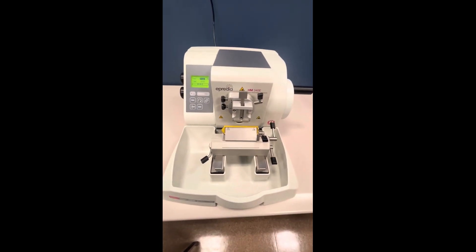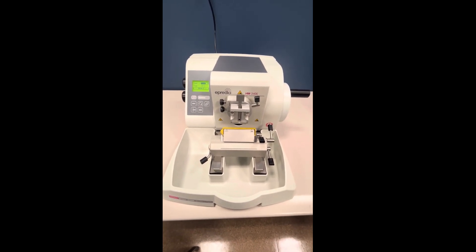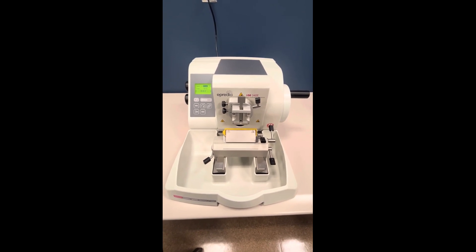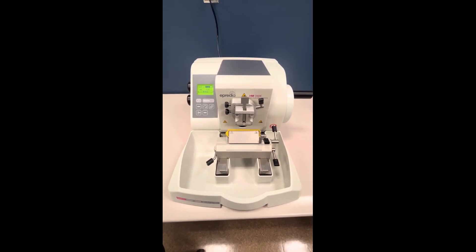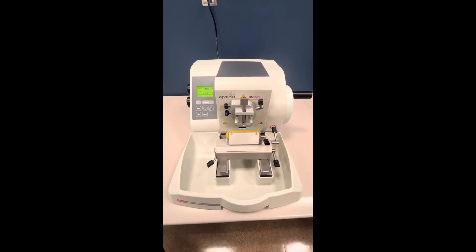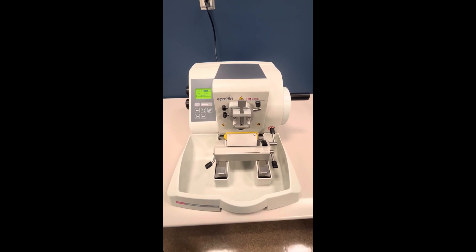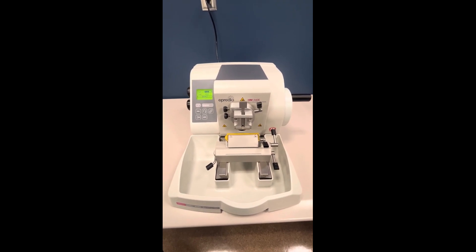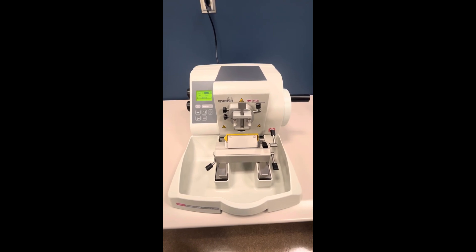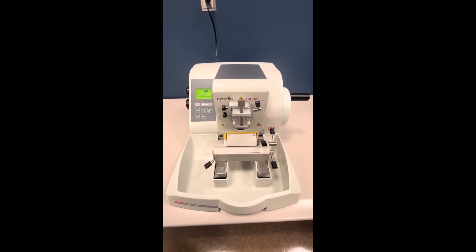This is the HM340E microtome from the company called Epredia. This is a semi-automated microtome. Microtomes are instruments used in the histology lab for slicing thin, uniform sections from tissue samples. This is what we call a rotary microtome, which is actually the most commonly used microtome type — it's called a rotary microtome because the actual cutting part is of a rotary action. This particular microtome can cut tissue sections from 0.5 microns up to 100 microns in thickness.